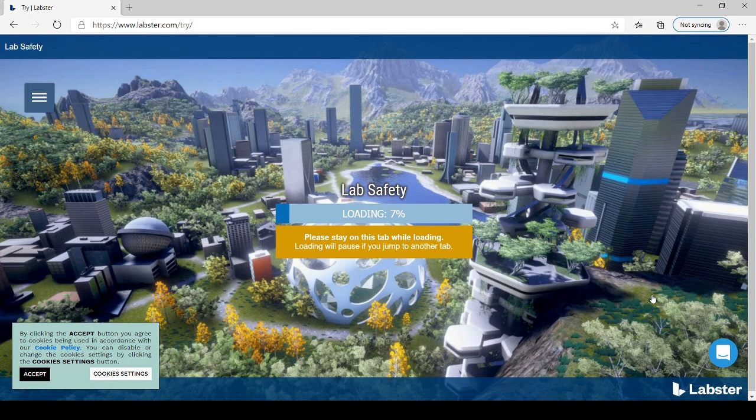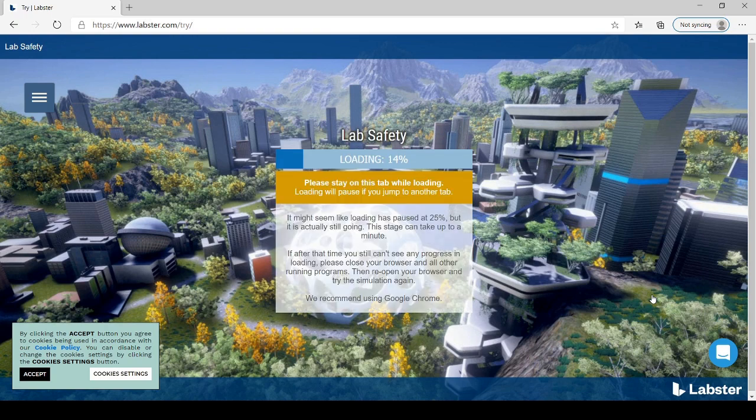Once we are done with the process, it asks for clicking on the link where our lab is getting prepared. Here you can see that a number of instructions are being forwarded to us which we can go through, and once the lab is ready, the entire virtualization will be there.